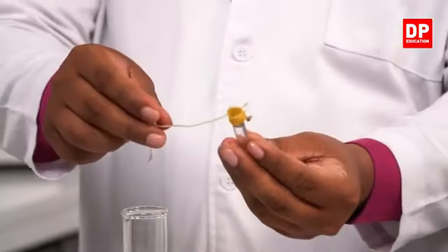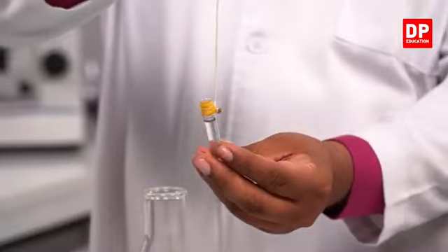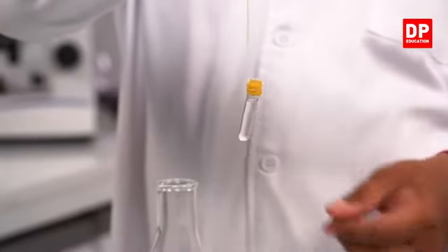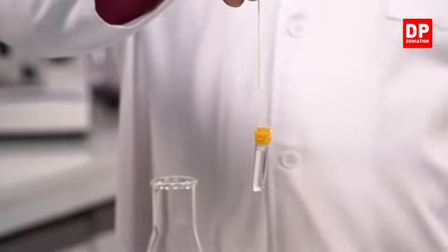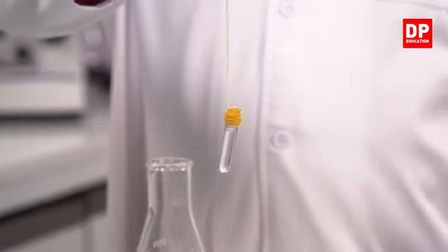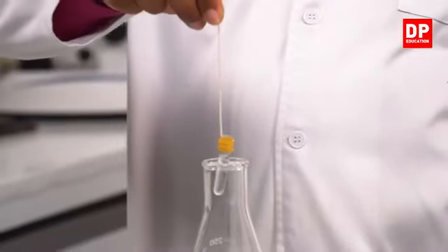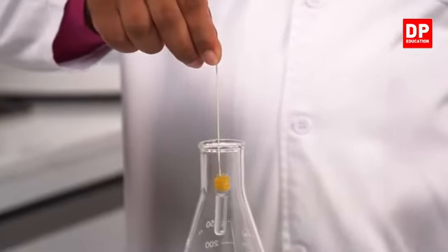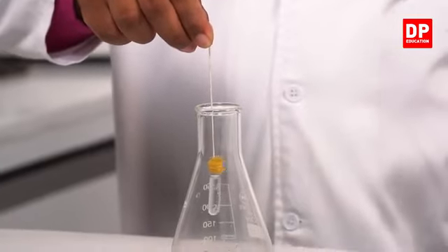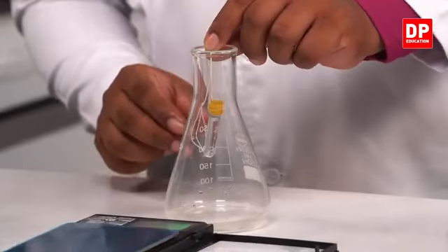Right. So here you can see within this ignition tube there is sodium chloride, and you can see the solution very clearly. I have added somewhat more water to dissolve all the sodium chloride in the ignition tube. Now I'm going to gently insert this into this system, very gently, and I'm going to keep it in this kind of position.